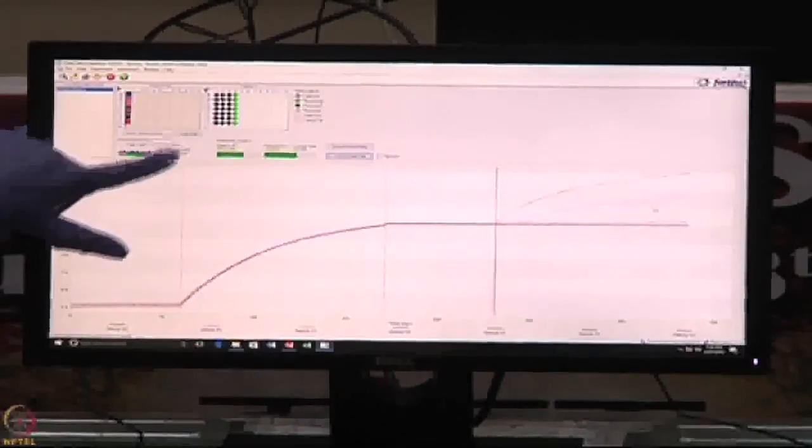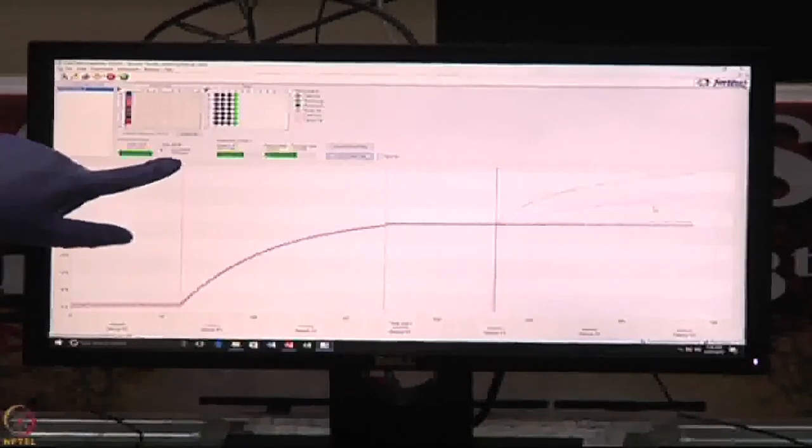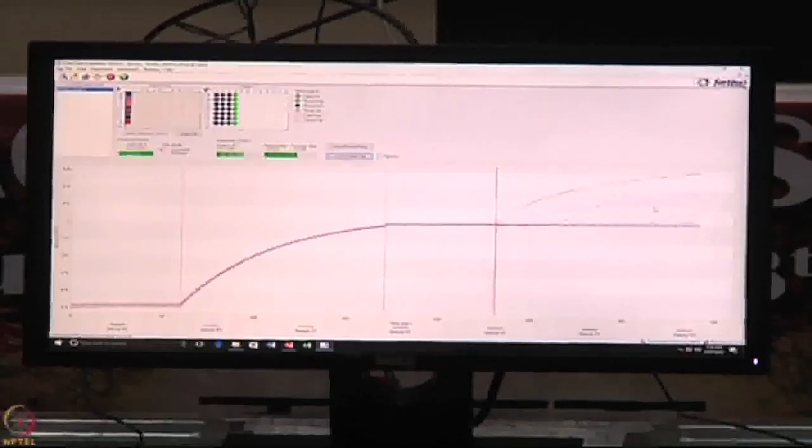I forgot to mention, we are working with 1000 RPM. The shaker range works from 100 RPM to 1500 RPM. Depending upon the application, we can choose the right RPM. Generally, when we are working with kinetics experiments, we go with 1000 RPM by default. When we do quantitation experiments, we generally work with 400 RPM, where we are working with microgram level concentrations, like 200 to 1 microgram in that range.